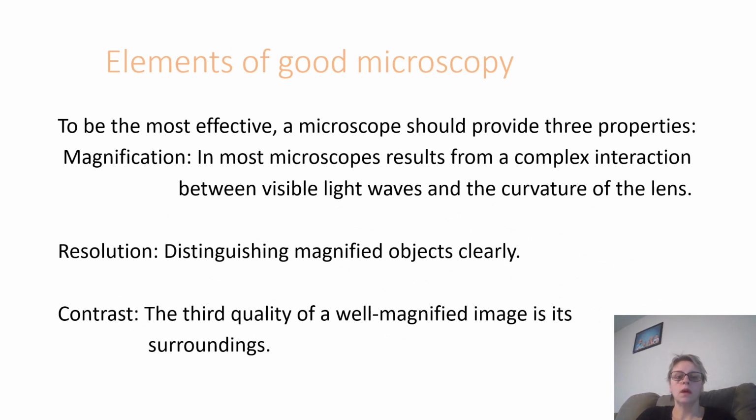Good elements of microscopy. To be the most effective, a microscope should provide 3 properties.